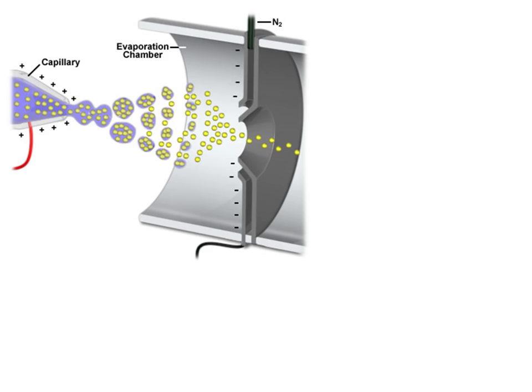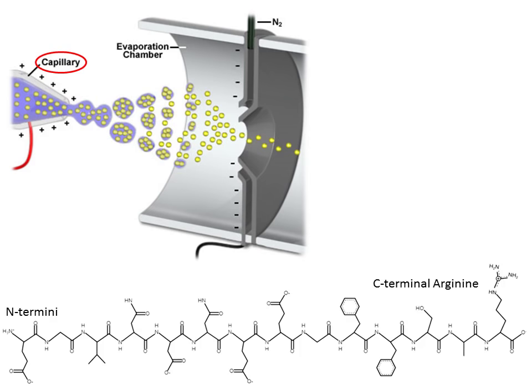The alternate form of ion source is electrospray, again invented in the 1980s by John Fenn. In electrospray, the peptide or protein is in a liquid that flows out of a capillary that is under high voltage, usually between 1500 and 5000 volts, depending on the flow rate of the liquid, with a lower flow requiring lower voltages. For peptides and proteins, the liquid is normally an acidified mixture of water and organic solvent such as acetonitrile. The acidic conditions means that there is an excess of hydrogen ions in solution, and the peptide molecules become protonated on their primary amines as previously described.